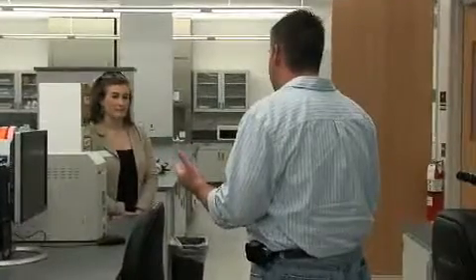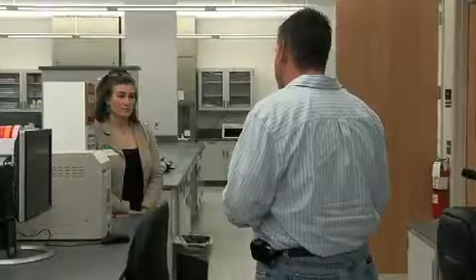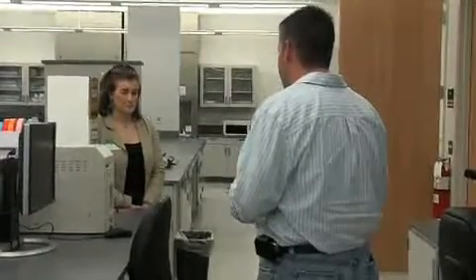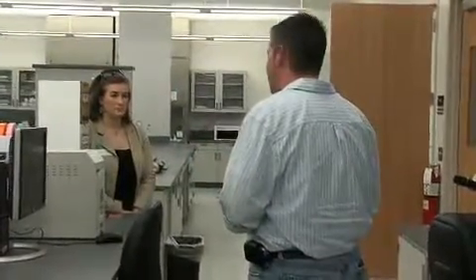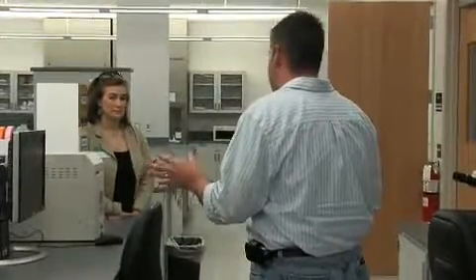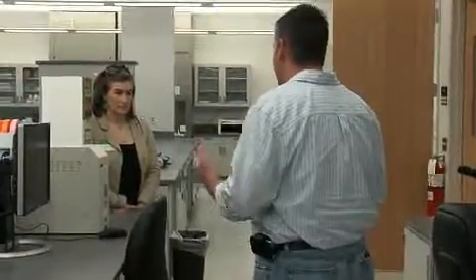It projects it up onto the monitor for us, so it reduces eye strain on the analyst because a lot of time is spent at the microscopes looking for the spermatozoa on the slides. So it reduces the eye strain, reduces the time because it's basically a point and click as opposed to actually scanning the entire slide. The other advantage of this is we can take immediate pictures of it. It's got built-in, we can use compact flash cards, or we can tie it into our network, which is what we're trying to do.